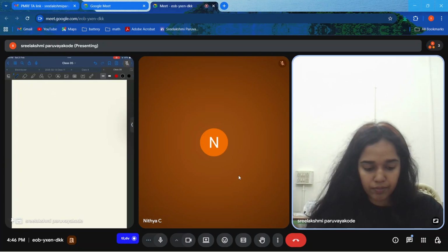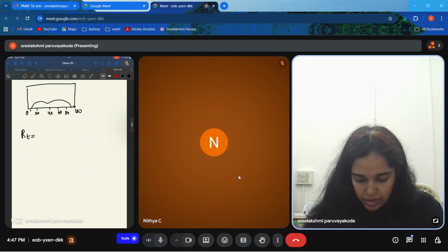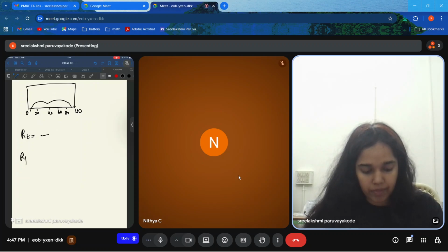Now the next one. I see a circuit like this. They have asked me to find out the value of RT and RP. Okay, here this is 0, this is 20, this is 40, this is 60, this is 80, and this is 100. So I know what I have to find out, what is RP. So we know directly RP.